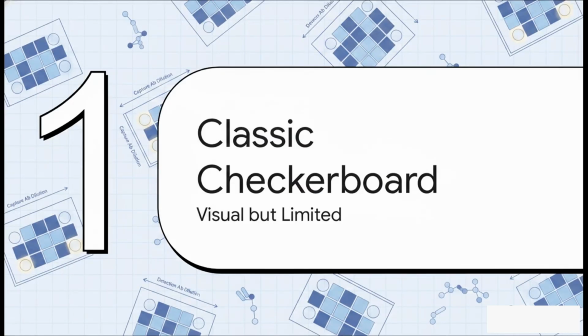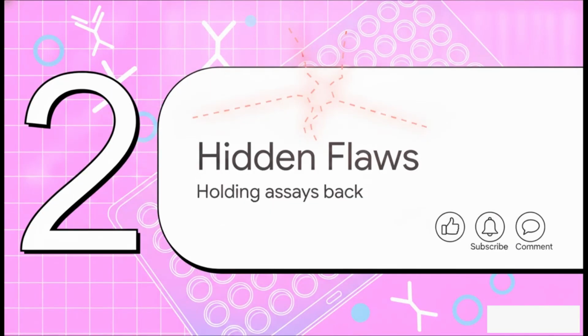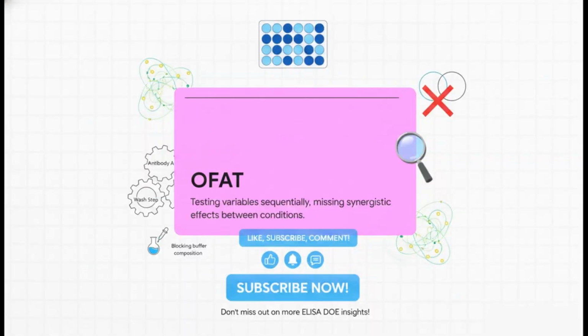The classic checkerboard approach. It's visual, it's intuitive, but ultimately, it's limited. Let's move right into the hidden flaws of checkerboards and why this classic method is holding your assay back. We all love the checkerboard, right? You dilute your capture and detection antibodies across a standard 96-well plate to just visually eyeball that sweet spot. But actually, this is a textbook example of OFAT, one factor at a time testing. It's a method where you're testing variables sequentially.